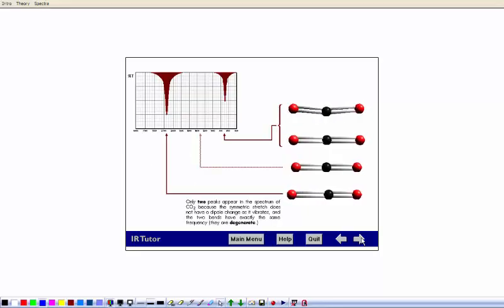If you take your car to have some sort of emissions check, in Ohio, E-Check, and I think in certain parts of western Pennsylvania there's an E-Check system as well, they'll check it for the amount of CO2 that comes out of your car. Now, if you have an older car where they actually have to stick the probe in the tailpipe, they use infrared radiation to measure the amount of CO2 coming out of the car. It's a relatively easy measurement to make, because CO2 absorbs infrared radiation, and specifically you'd look at the wavelengths of those two peaks. And you could create a Beer's law calibration, and you could get the CO2 concentration very easily.